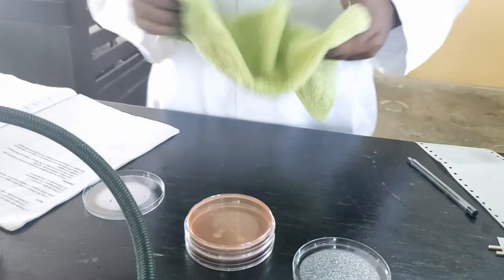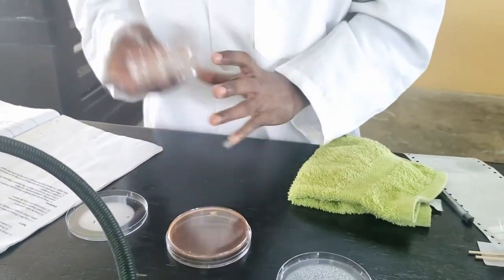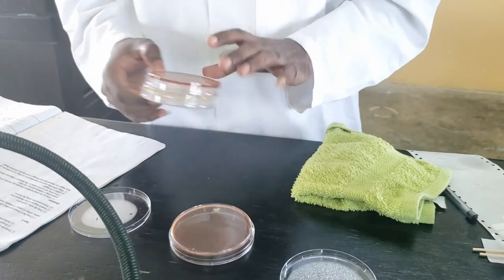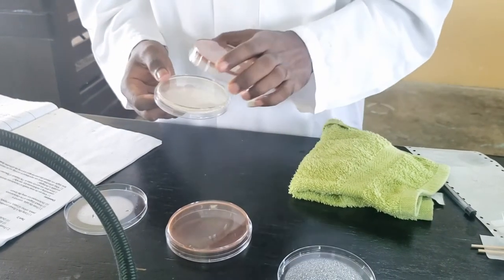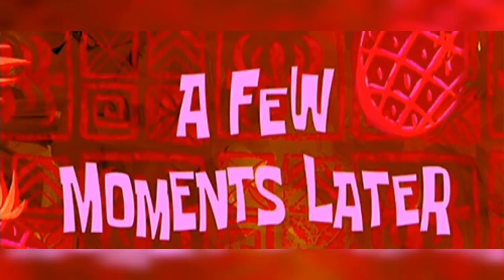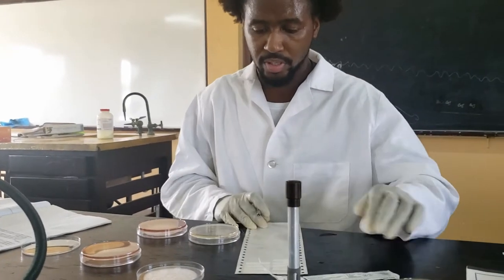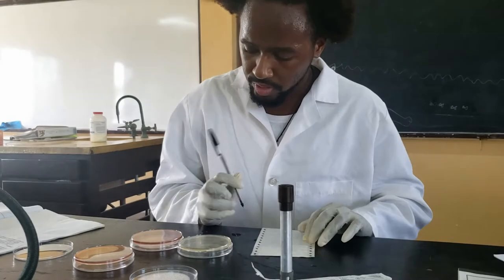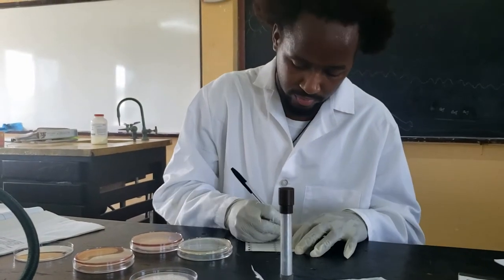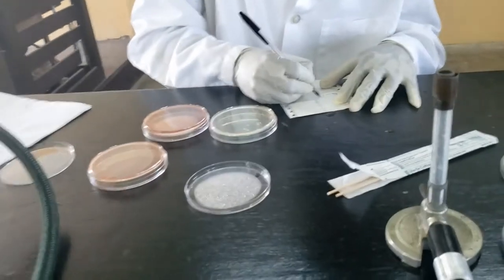And the last ones, we're going to just take to the bathroom and leave these there for 15 to 20 minutes. So we'll just leave them exposed in the bathroom. So we're back with the last two plates that were in the male restroom here on campus, exposed for 15 minutes.